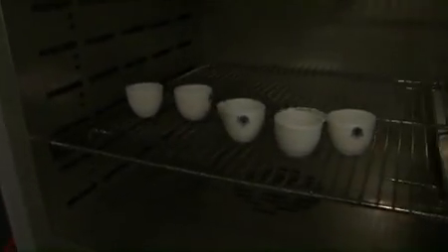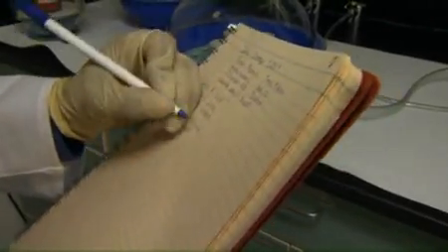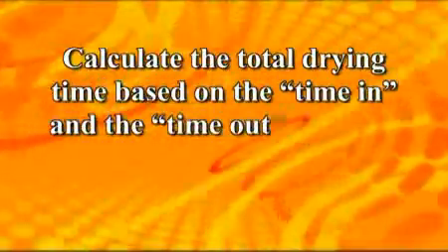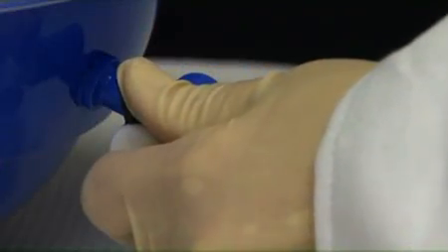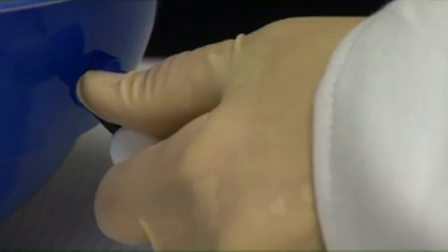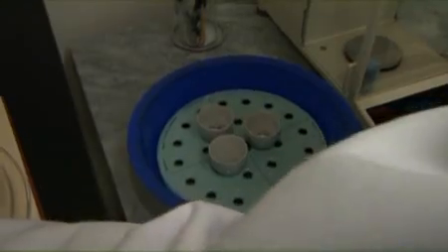At the end of the required time, use tongs to remove the samples from the oven and place them in a desiccator under vacuum to cool. Allow the samples to cool for a minimum of 30 minutes. Immediately record the time the samples were removed from the oven, and calculate the total drying time based on the time in and the time out to verify that the test method was followed accurately. After the samples have cooled for a minimum of 30 minutes, release the desiccator vacuum extremely slowly, as releasing it too rapidly may cause containers to overturn or sample materials to be lost, resulting in inaccurate percent moisture results.